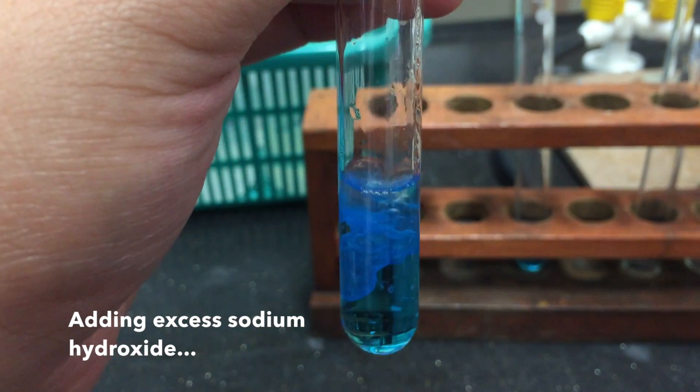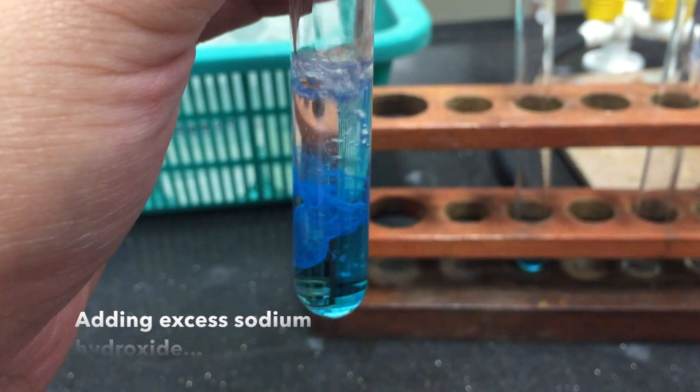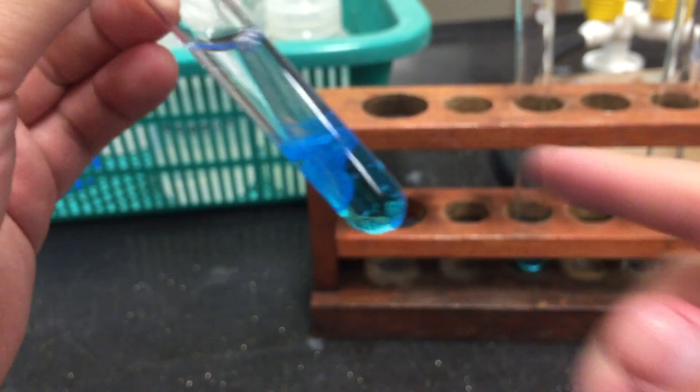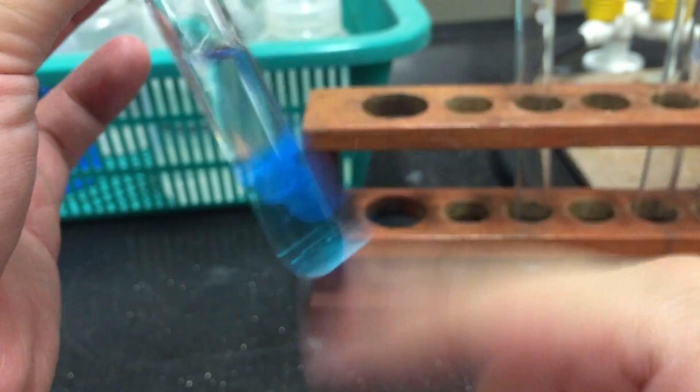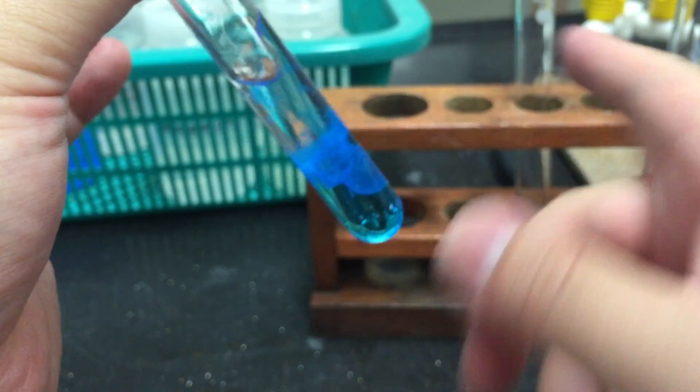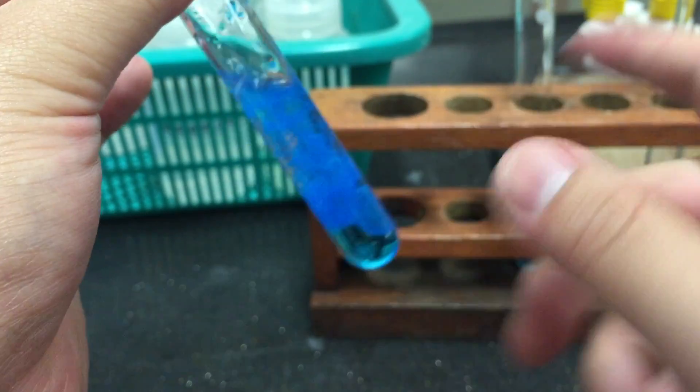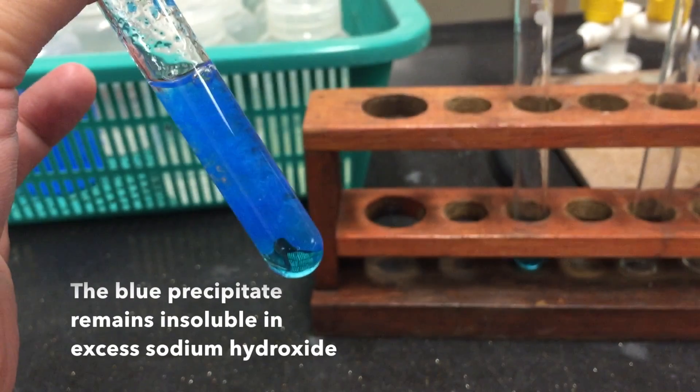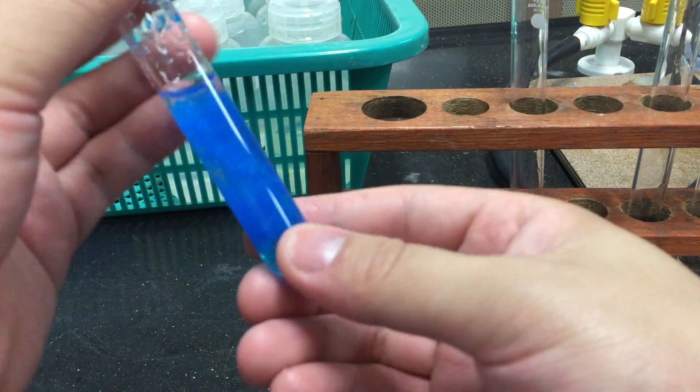Next, add an excess of sodium hydroxide. Shake the test tube to ensure thorough mixing. You will notice that the blue precipitate remains insoluble in excess sodium hydroxide.